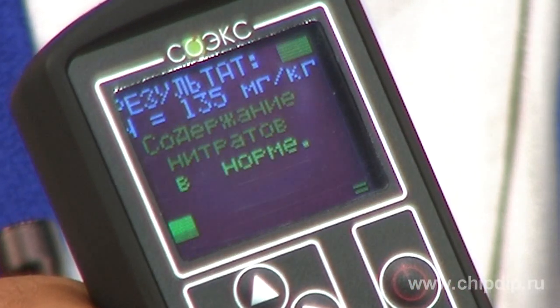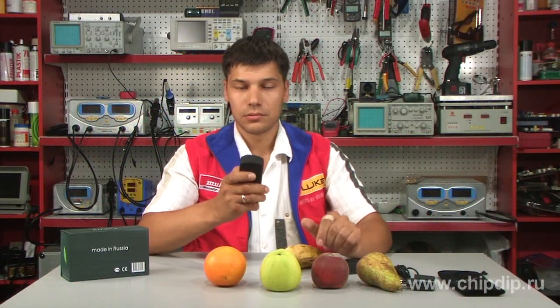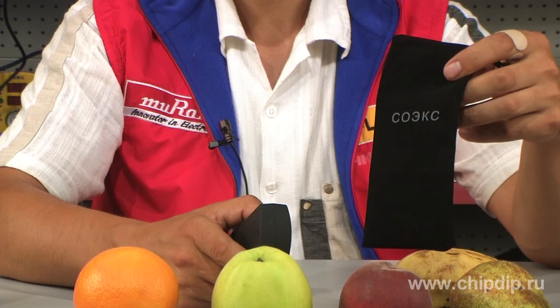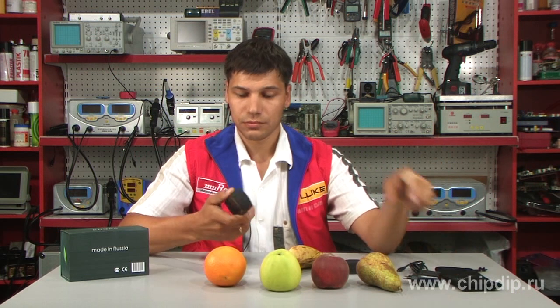Wait a while and see the result. In our case, the tester shows that the nitrate level is normal. The tester comes with a convenient case, a charger, a battery, and an instruction manual.